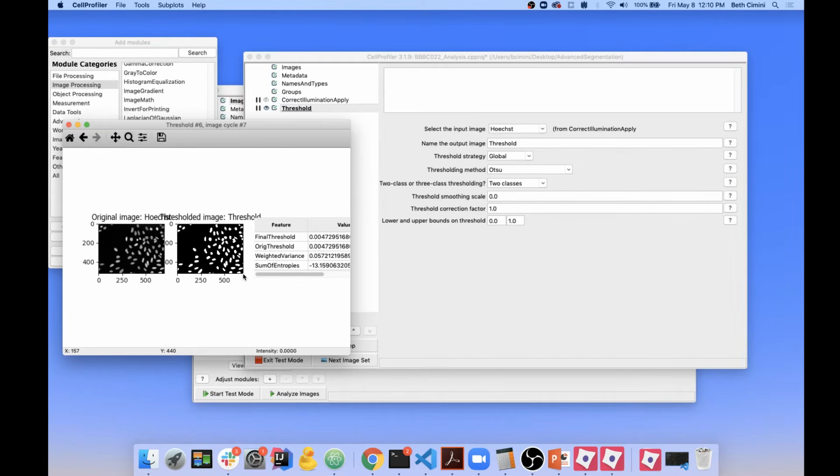So what you can hopefully also see is there are a range of values that might actually be correct for any given image, which is why, again, a manual threshold can be not a great thing to do.